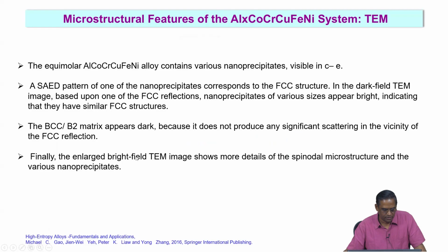Of course, the enlarged view of this TEM image shows much more detail about this spinodal microstructure and various nanoprecipitates. So this is a summary of this.